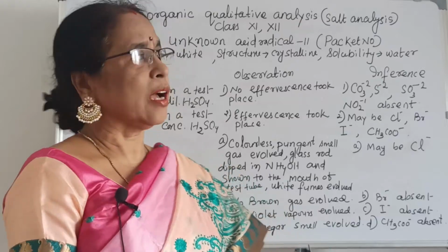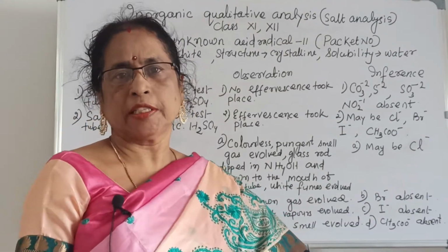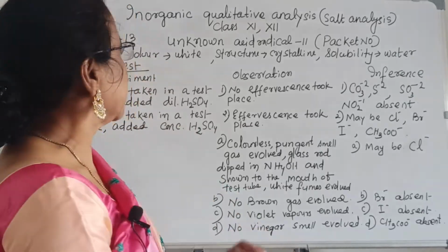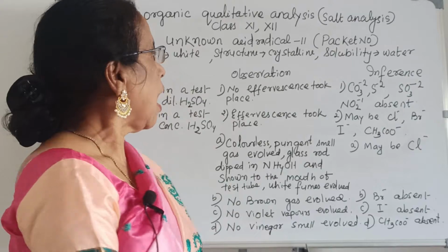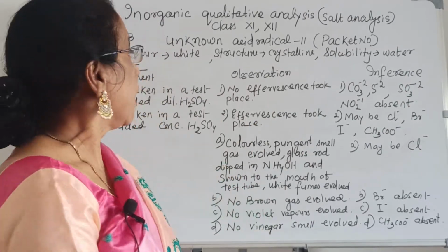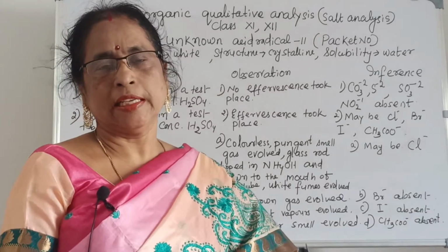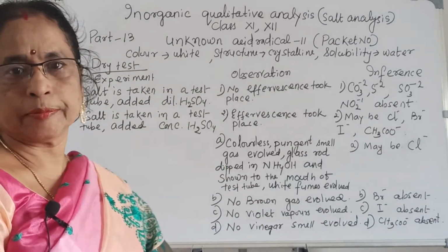Here I am going to explain inorganic qualitative analysis, that is salt analysis, specially referred to unknown acid radical. I have already completed 10 acid radicals, and now this is the 11th acid radical.